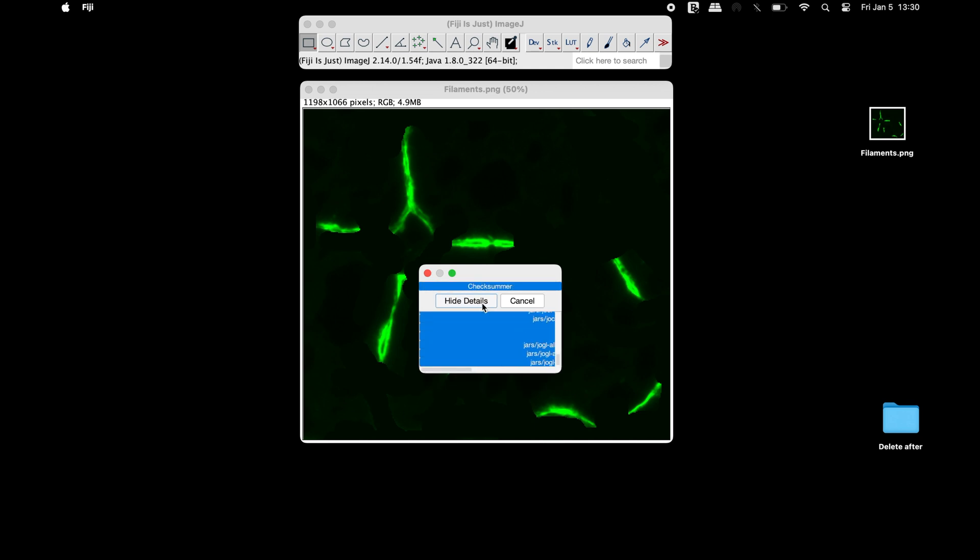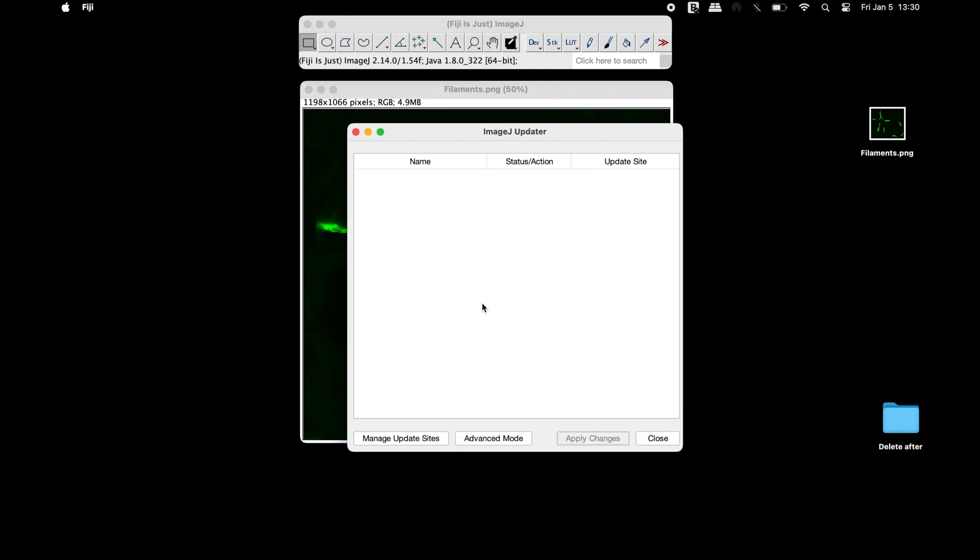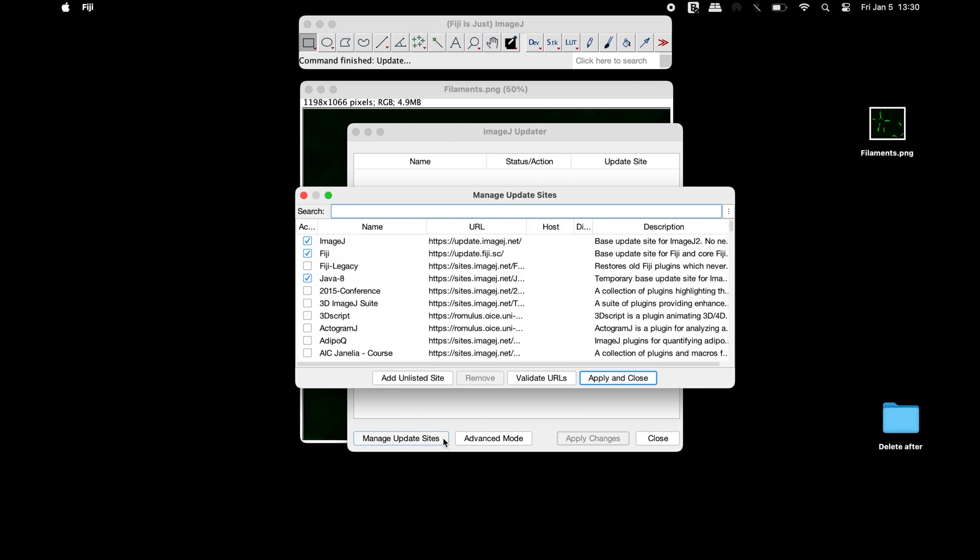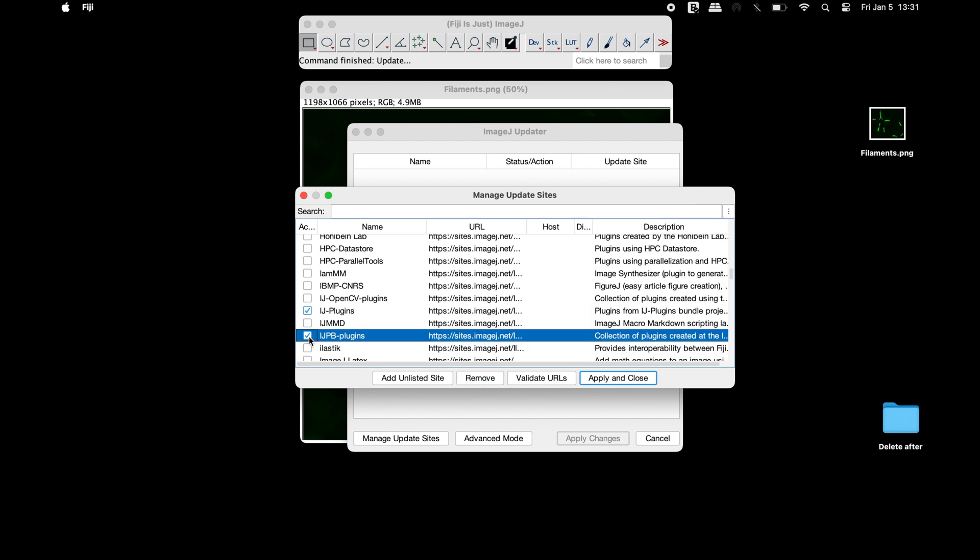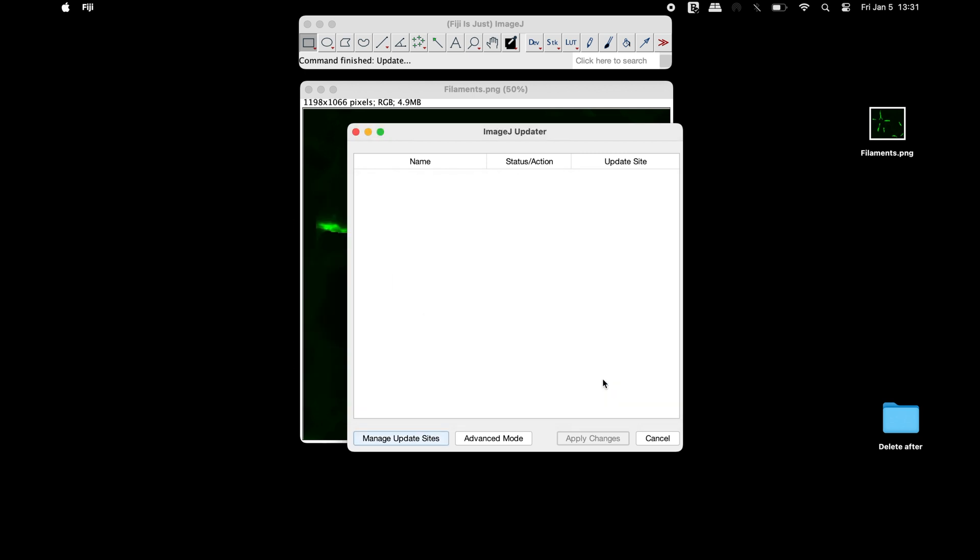Once the update is completed, click on manage update sites and scroll down to find IJPB plugins. Now click apply and close.